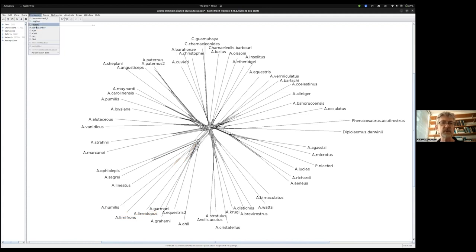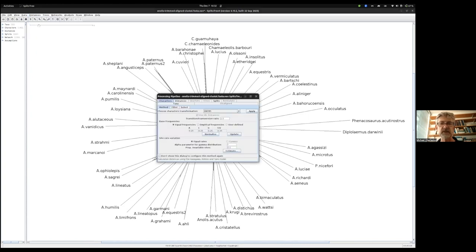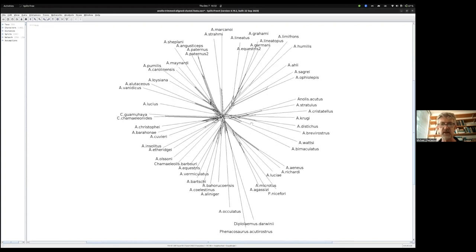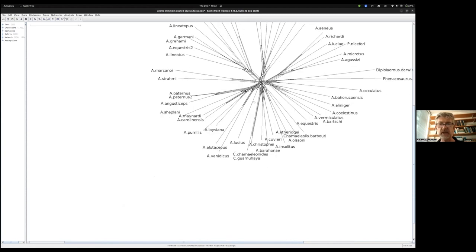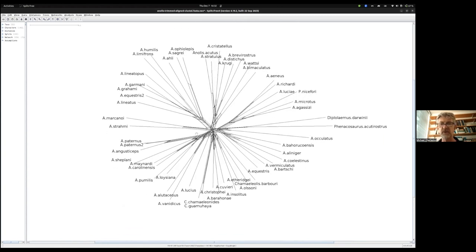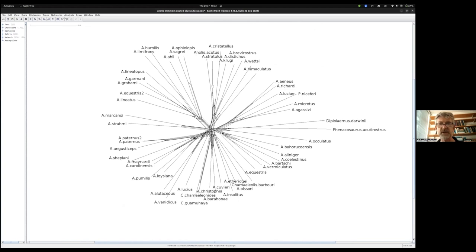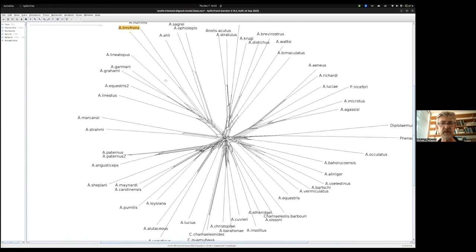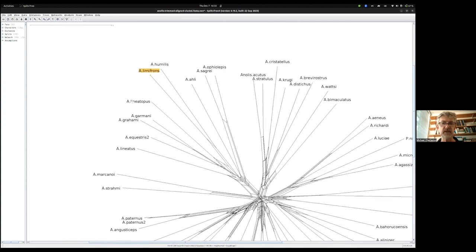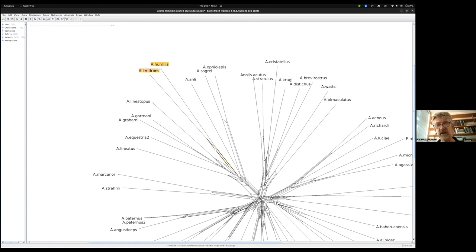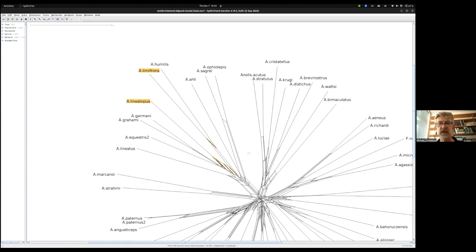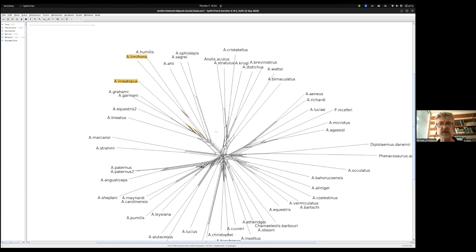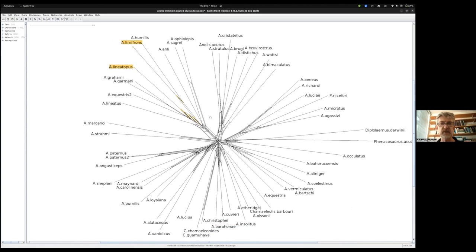Let's try another distance measure now. Another model that we spoke about was HKY-85, so I'm just going to select that, apply, and rotate around so things are more or less in the same place. It's a good place to pause the video and see whether things have moved or not. Let's see if we can find our limifrons of interest. Limifrons, lineotopus, and humulus. If I click on this split here, it does look a bit longer than in the previous distance measures. Still a reasonable story.